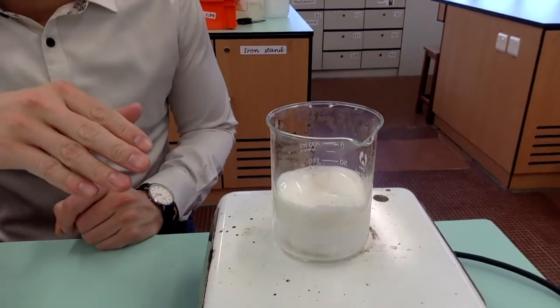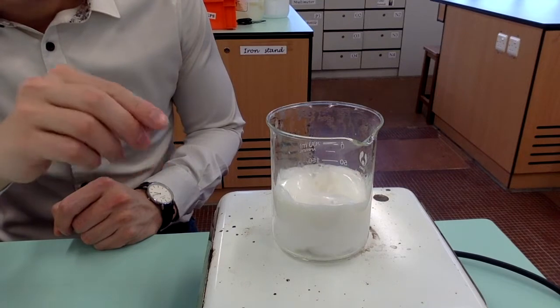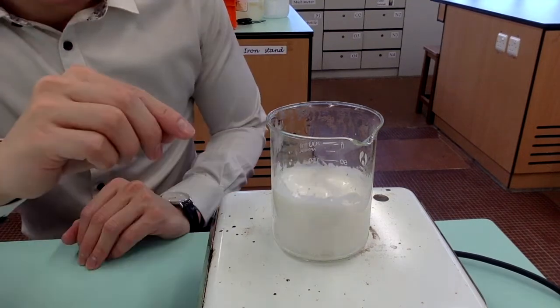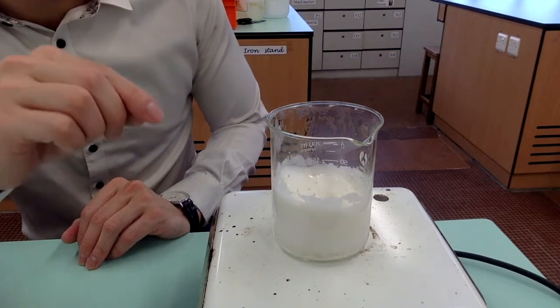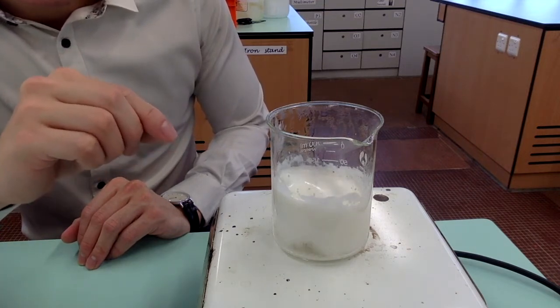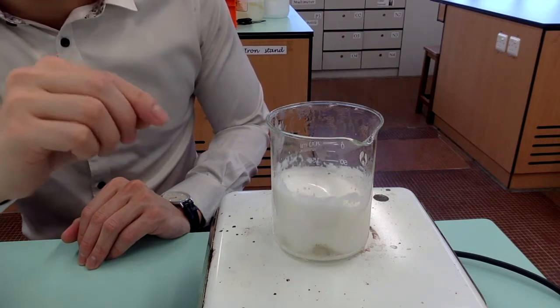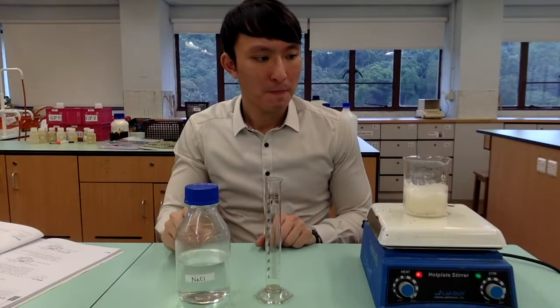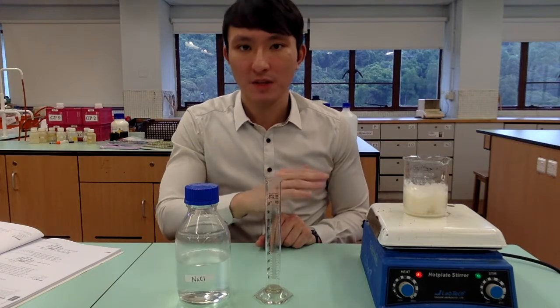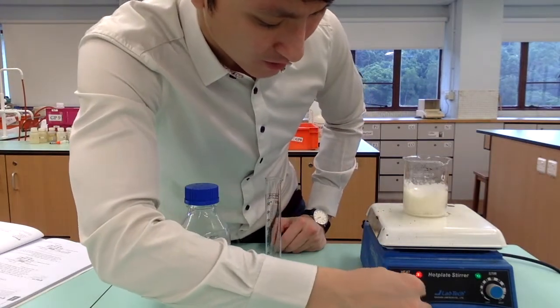Now after heating for 15 minutes, you should be able to see the formation of lather and foam. And you should also check to see if there are still two layers of liquid. If there are no two layers of liquid, then you can stop the heating. Now I will stop the heating by turning off the heater.